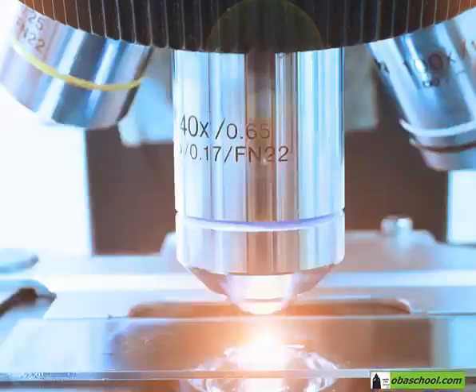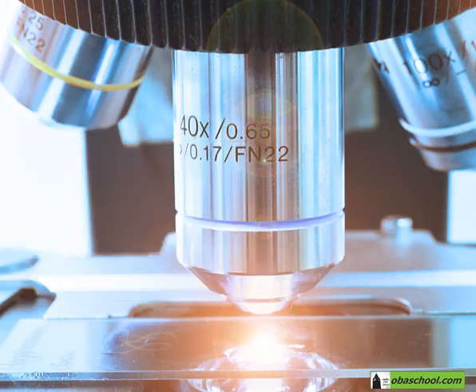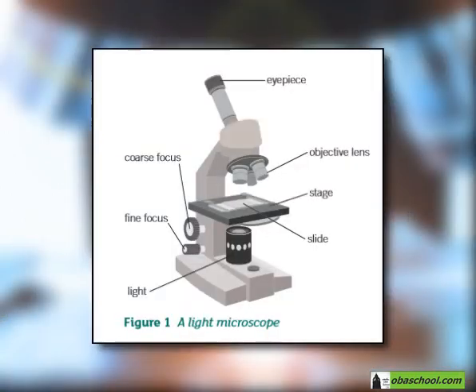Light microscopes use a beam of light to form an image of an object, and the best can magnify around 2,000 times, although school microscopes usually only magnify several hundred times. They are relatively cheap, can be used almost everywhere, and can magnify live specimens. This is a drawing of a light microscope. This is typically what it looks like.